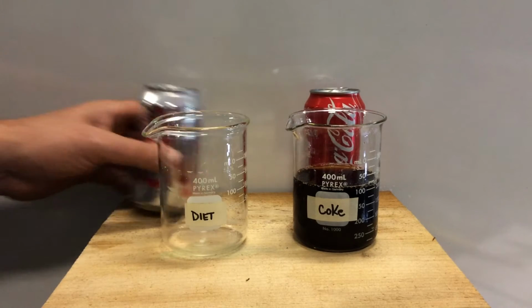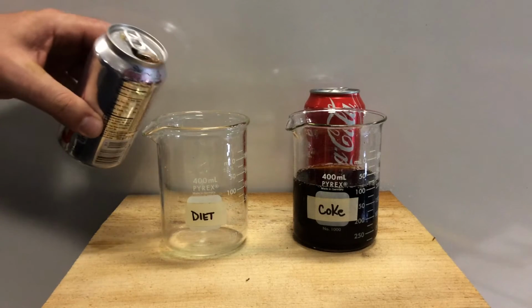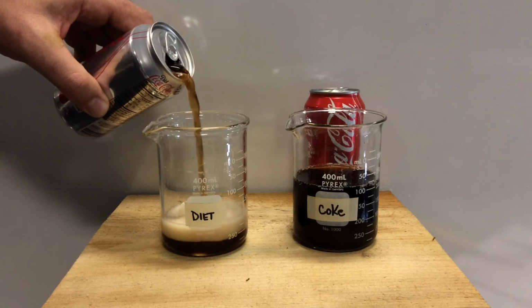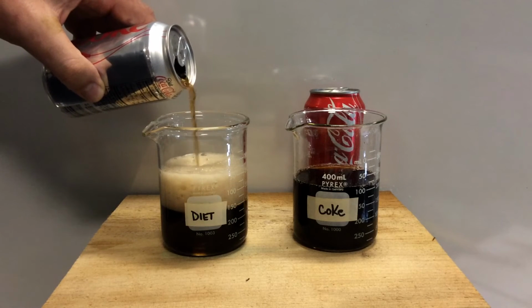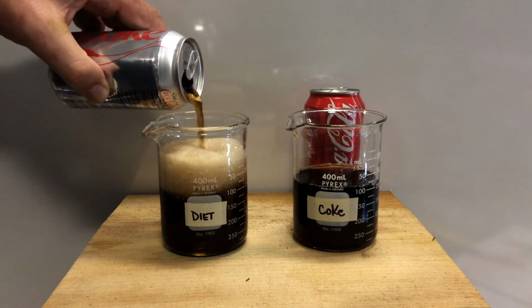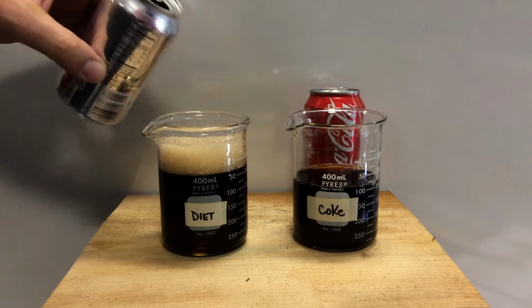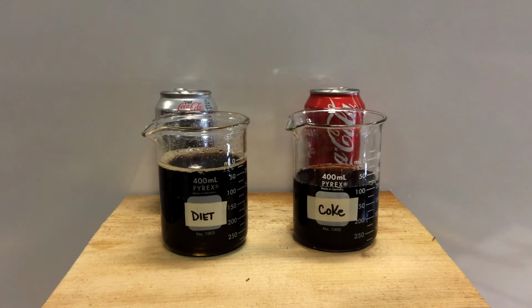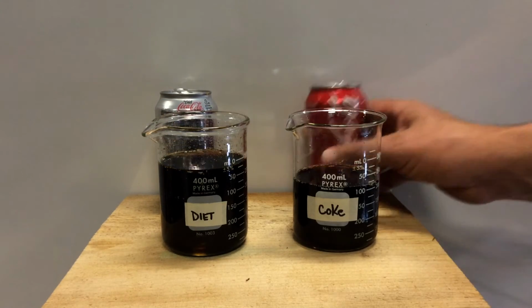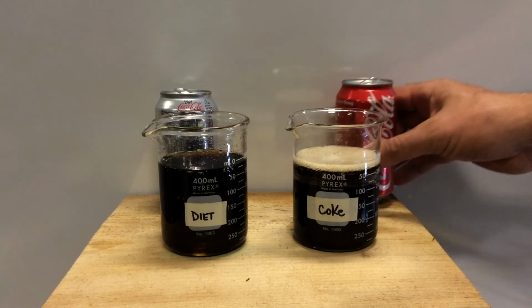Now that may change our observations a little bit from what we expect based on water, but it won't change the fact of how Diet Coke and regular Coke may differ. Or does it? Again, we're assuming that they're the same ingredients. So what we're going to do here is let it go flat for a couple of days so that we're able to better use and measure without the problems.